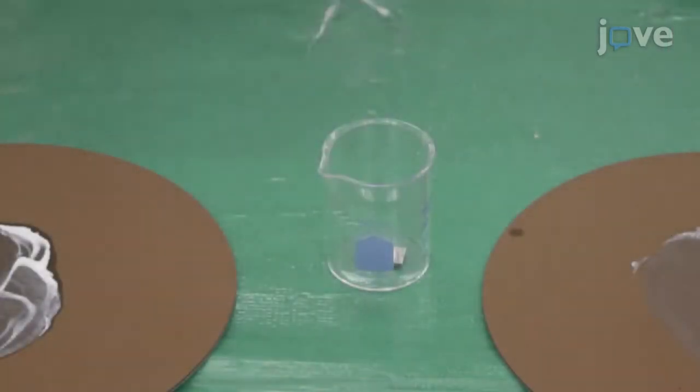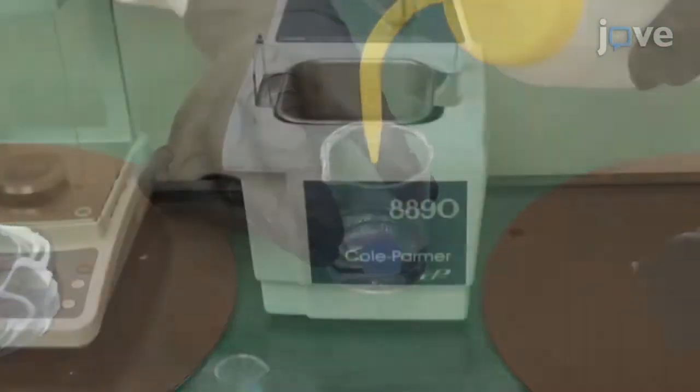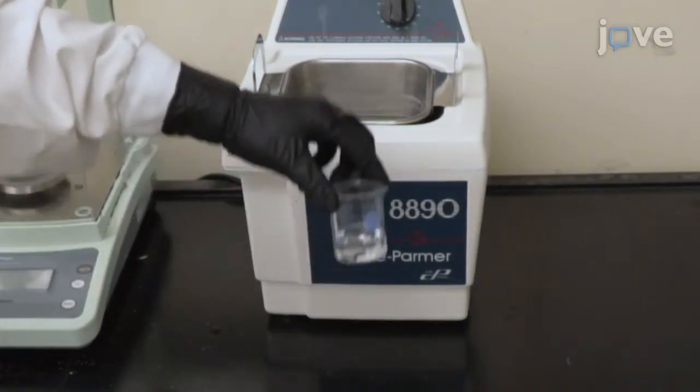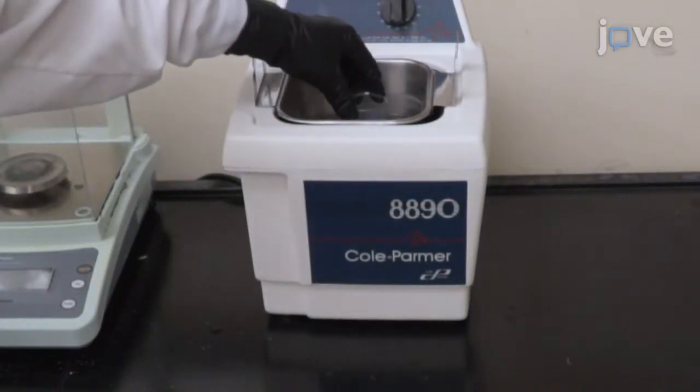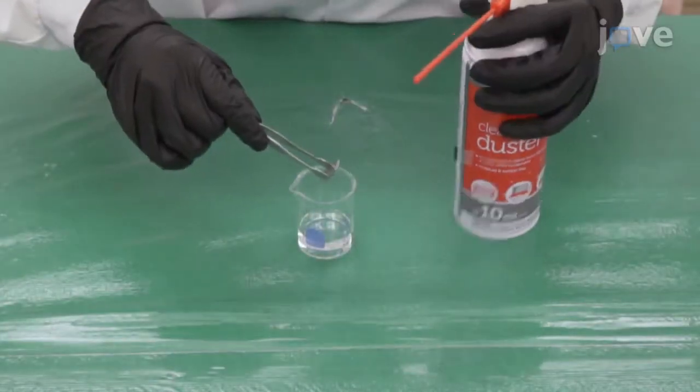Place the polished specimen in a beaker with 40 milliliters of deionized water and transfer the beaker to an ultrasonic cleaner for one to two minutes to remove any surface particles. Then use compressed gas to completely dry the surface.